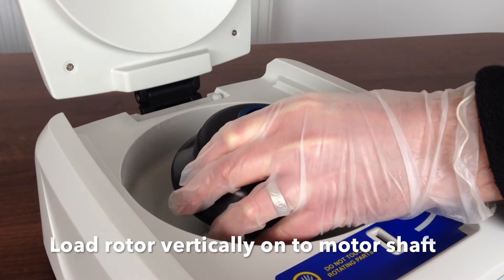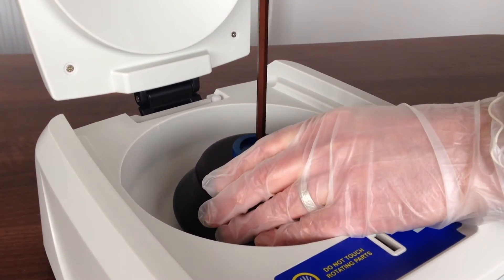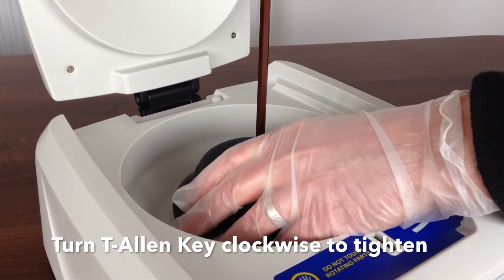Load the desired rotor vertically onto the motor shaft. Secure the nut with the T Allen key, turning it clockwise to tighten. Ensure the rotor is firmly secure and the rotor lid is in place before running the centrifuge.